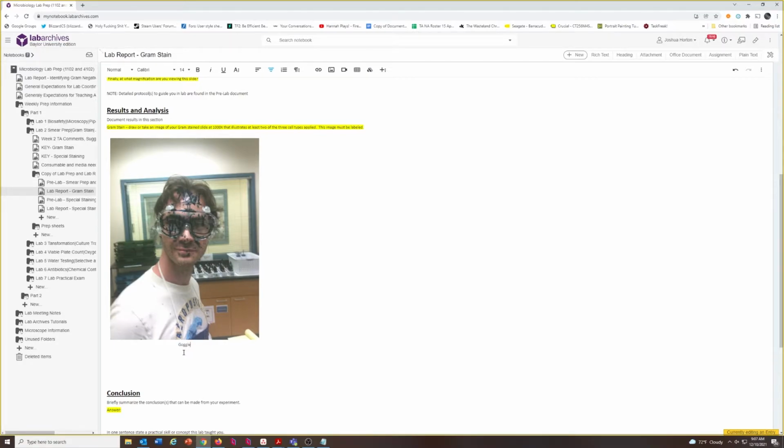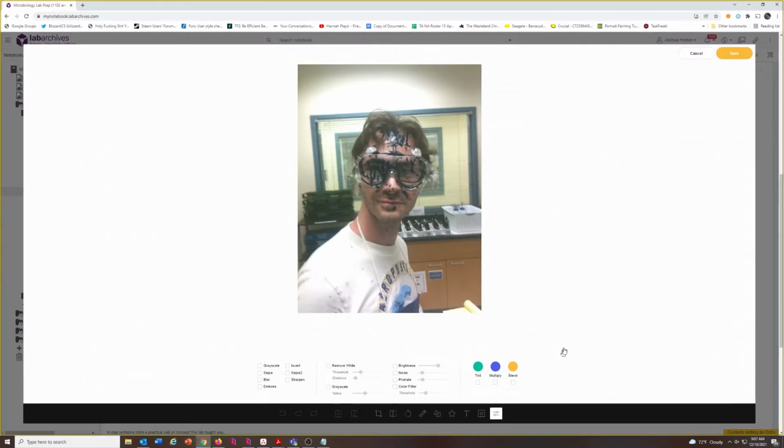Goggles are good. But let's say I want to put specific annotations in the image for different areas. I can do an advanced edit, and this gives you a whole bunch of different options over here. So for example, we can put over here some text that says splash damage. And now we have this text highlighted here.